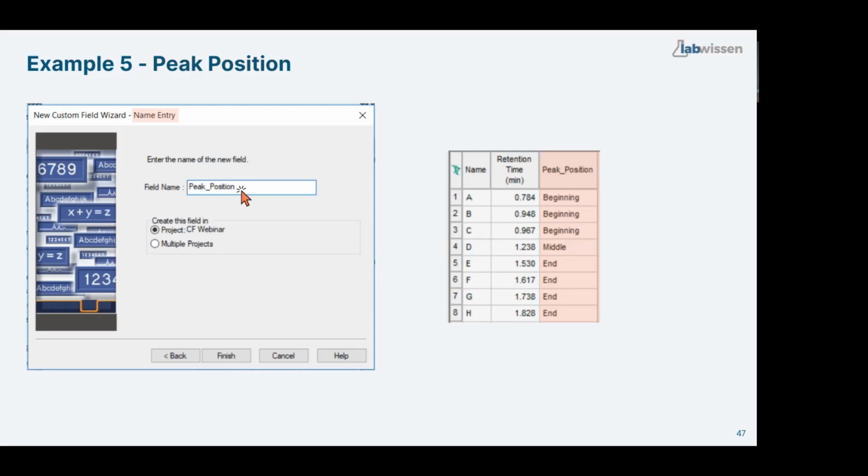Is it possible to get a complete list of default custom fields in Empower? There is no such list. If you mean the custom fields that appear with every new project, you will see them in the project, and that's it. There are 7 of them, but there is no other list of the most commonly used custom fields. Everyone creates their own database of custom fields, so when something similar comes up, it's easier to create a new one.